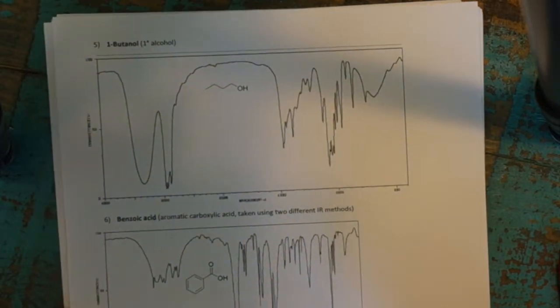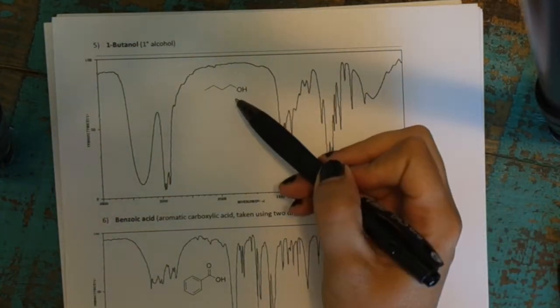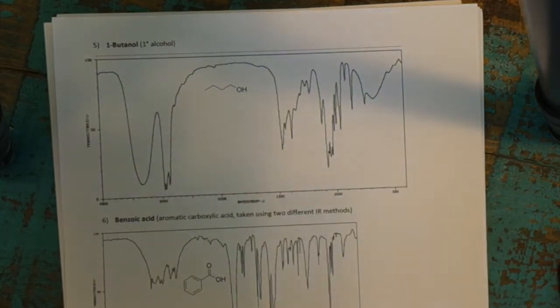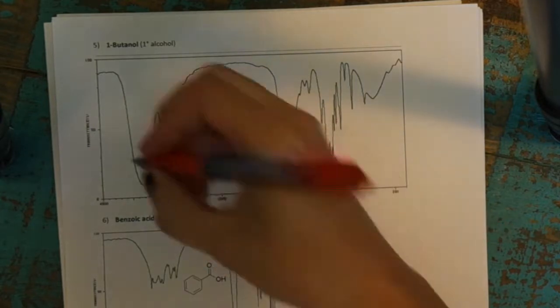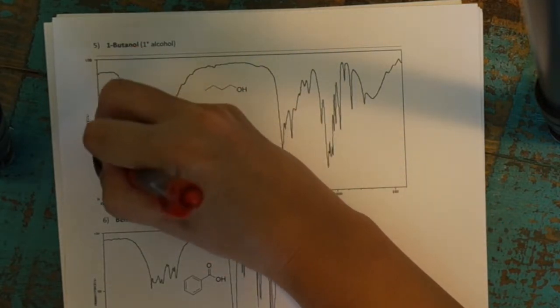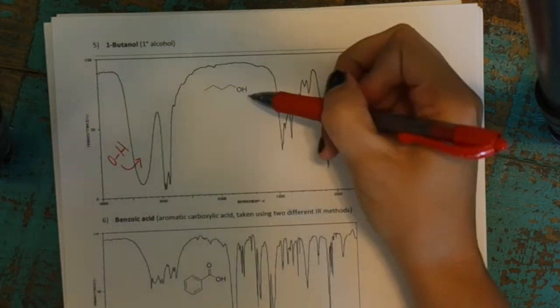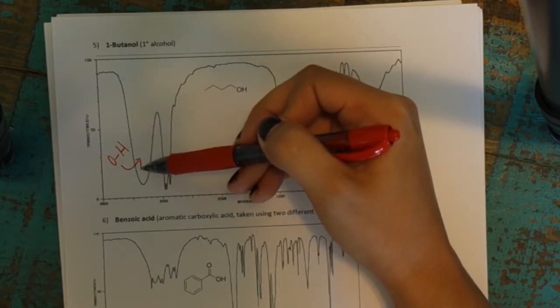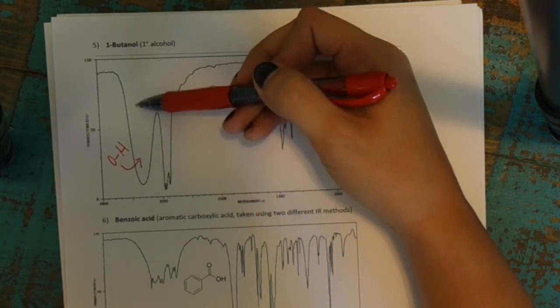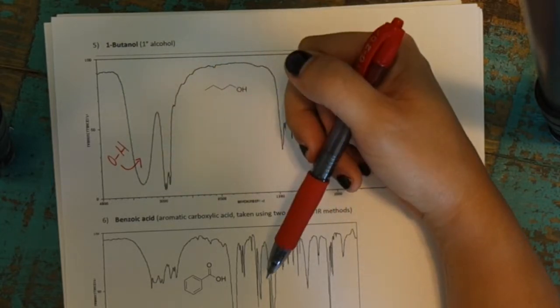In our first example from your sample spectra handout, this is a typical alcohol, a textbook classic alcohol. You can see there's this big, broad blob to the left of 3000. That's your OH from your alcohol. So that's a very classic looking one. Again, this can vary in size. This one's very, very strong. They're not always strong like that. Sometimes they're shorter, sometimes they're broader. So they'll differ in appearance. It doesn't look the same every single time.